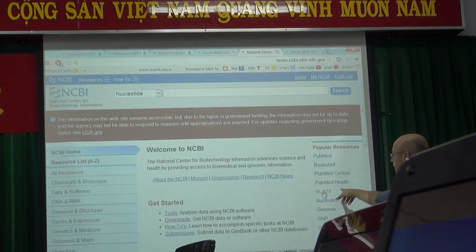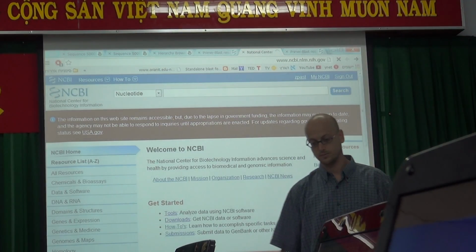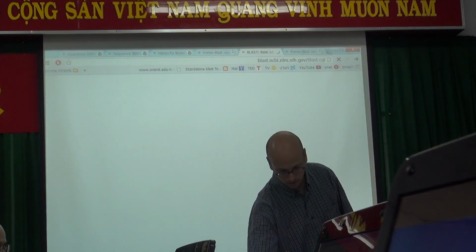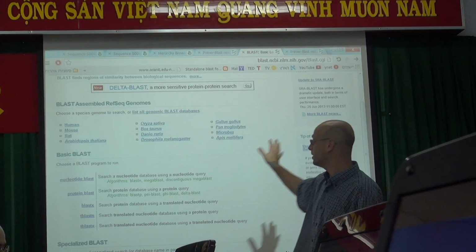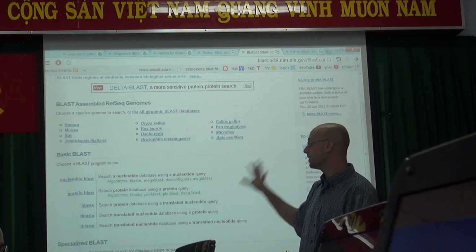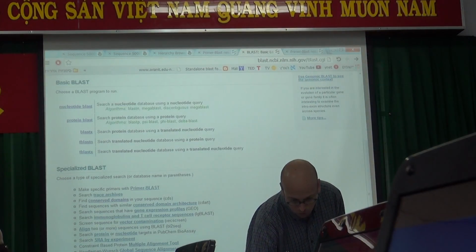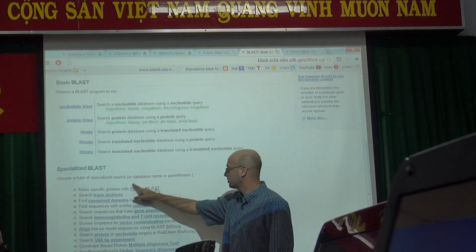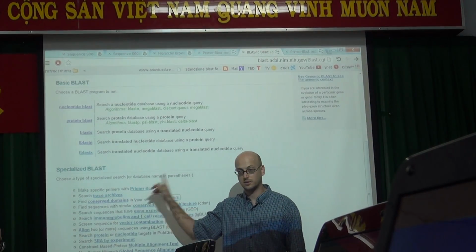Okay, we click on BLAST to go there. Okay, so this is the BLAST page. We will talk about this next week, not now. For now, all that we want to do is go down. So we go down the page. And what's interesting for us now is this, primer blast. Make specific primers with primer blast.